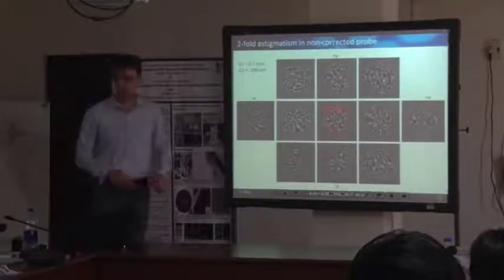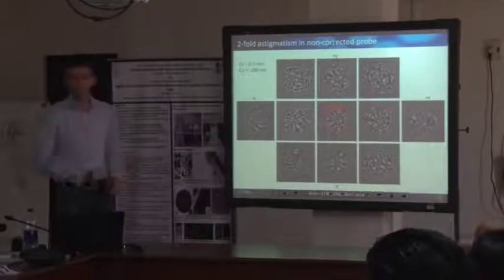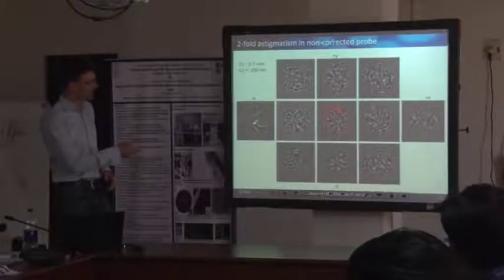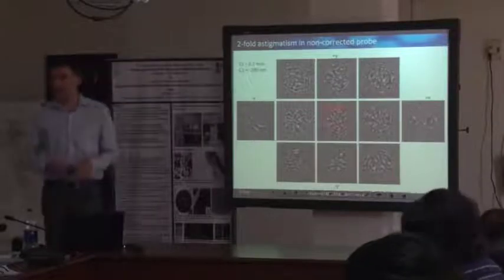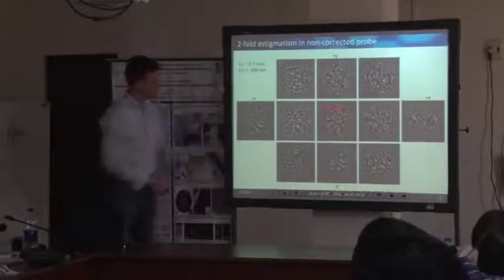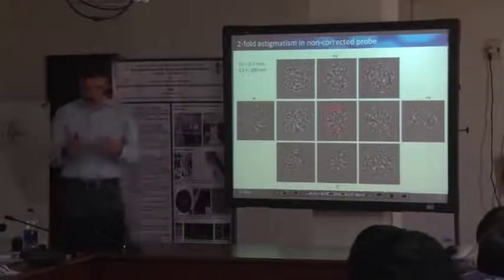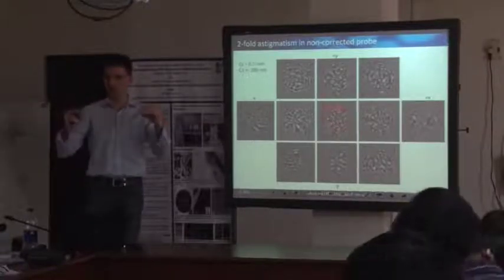This is how astigmatism looks like. So this is a perfectly aligned probe. This is still not focused here, but just to demonstrate how the astigmatism looks like. The worse the astigmatism gets, you will see some streaking here in a certain asymmetry. So this is already elliptical. If astigmatism is severe, this ellipse will be pretty pronounced. But in principle, this is just some, let's say, minor astigmatism, so you will see some streaking. Meaning that in one direction, your probe is already focused well, but in the other one, you end up with a finite magnification of your structure.